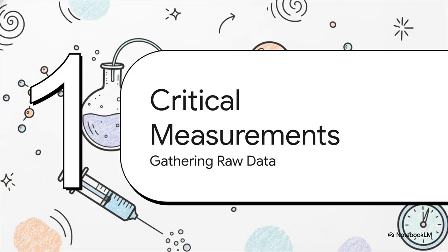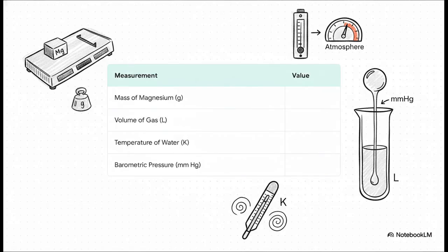All right, we've captured our gas. Now it's data time. And I gotta tell you, the success of our entire mission really hinges on how carefully we take these next few measurements. Precision is everything here. So, we need to record 4 key pieces of information.